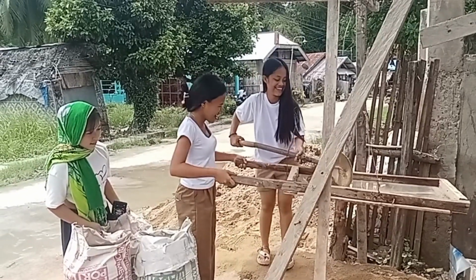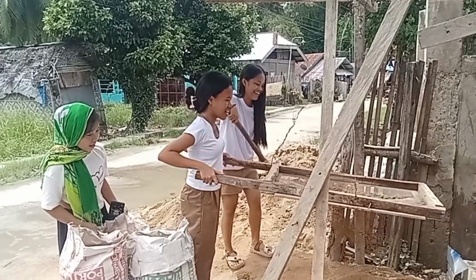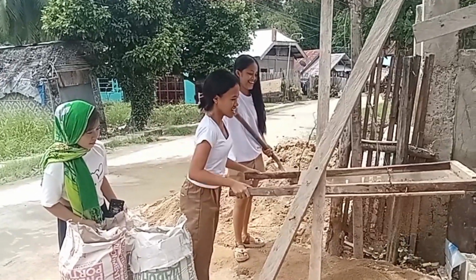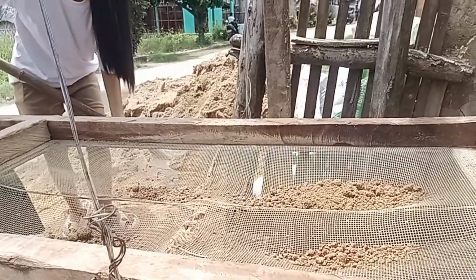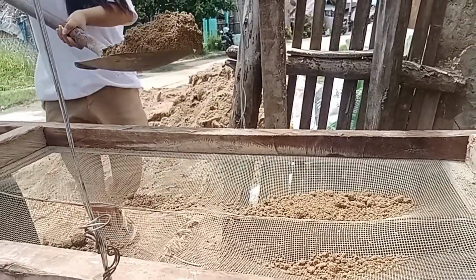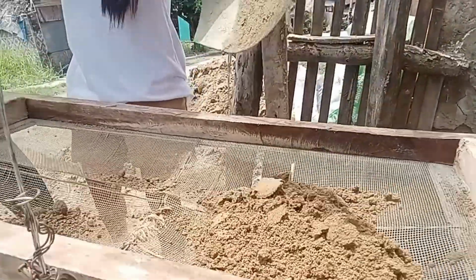First, place the sieve on top or hang the sieve. Second, pour the mixture of sand and gravel into the sieve. Third, shake the sieve gently. After shaking, we can observe that the smaller sand particles pass through the sieve while the larger gravel pieces remain on top.